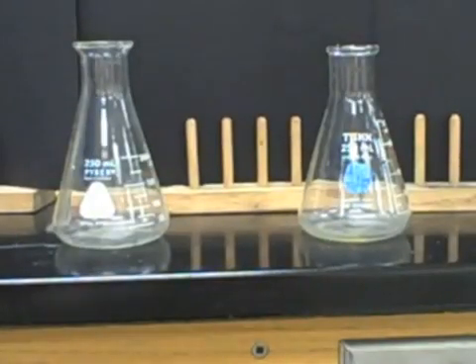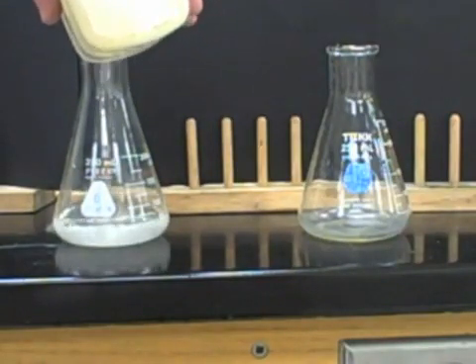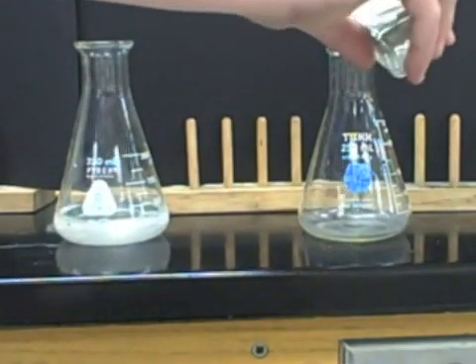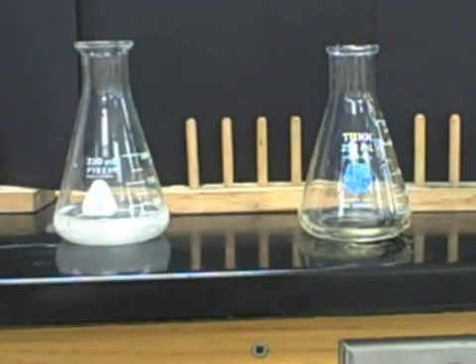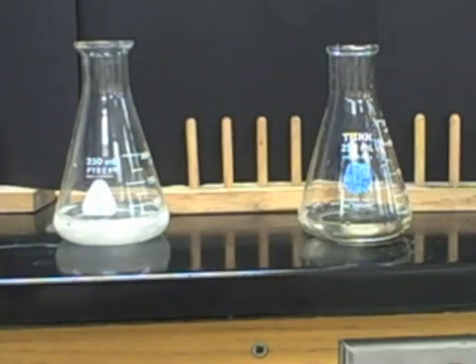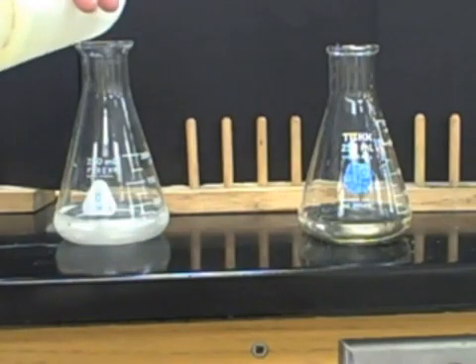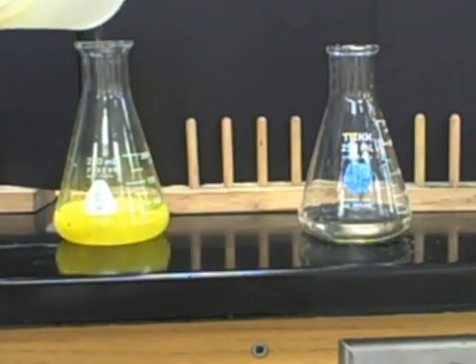So this is for the grand finale. We've got lead nitrate into a flask. And now we're going to do silver nitrate in another flask. A little bit of a spill there. I'll have to clean that up. And then for this one, we're going to add some potassium iodide to the lead nitrate for the awesome precipitate. Yellow precipitate. Look at that.